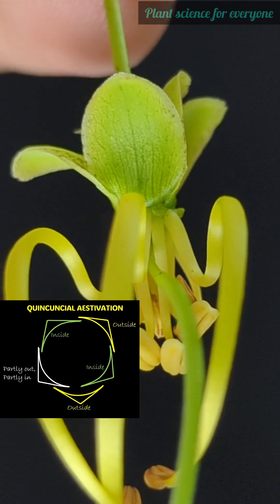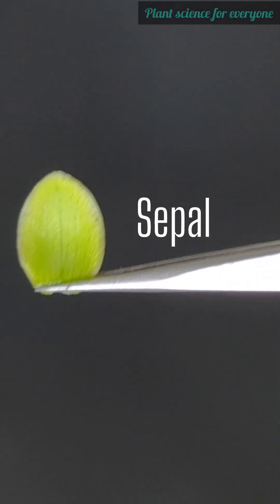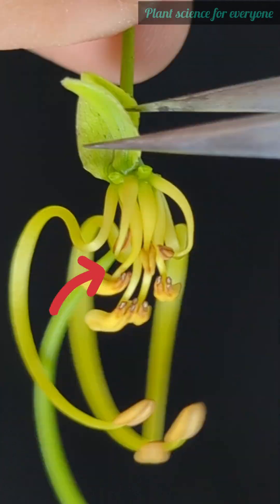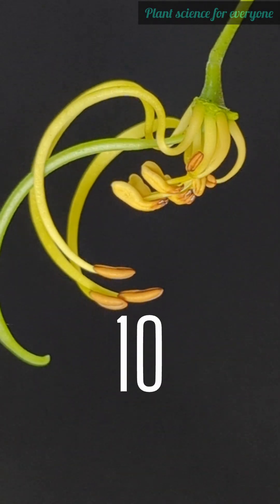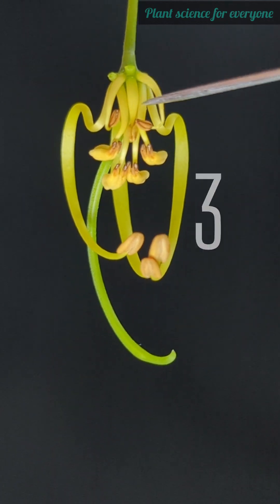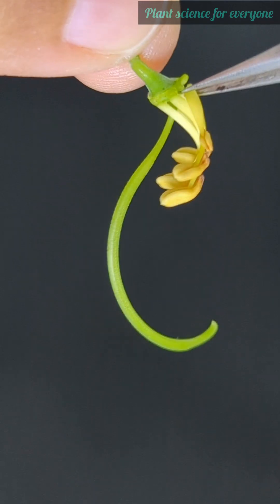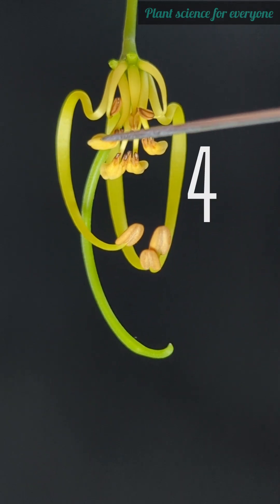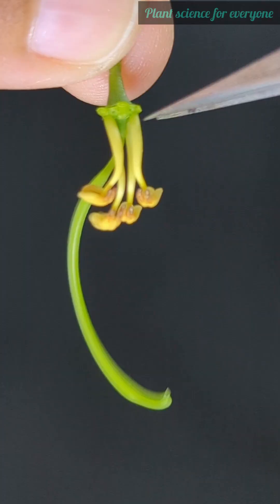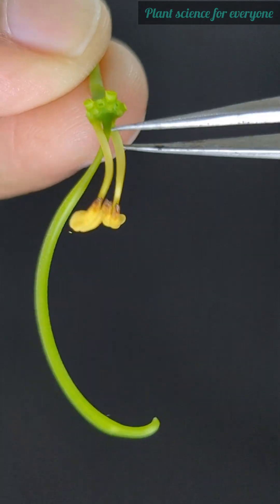Let's remove the sepals one by one. The yellow curved parts are the stamens — the flower's male reproductive organs. There are 10 stamens in total. The top three are the shortest and have anthers attached at the base — that's called basifixed. Many sources say they are sterile, but they are actually fertile. The median four filaments are straight and have a versatile anther, where the filament is attached at a single point on the back of the anther, allowing it to swing freely.